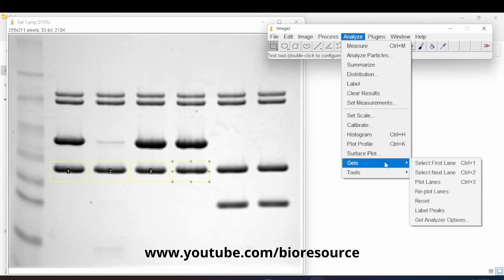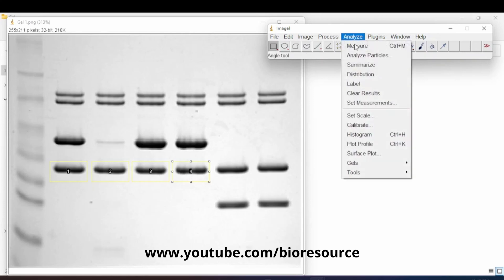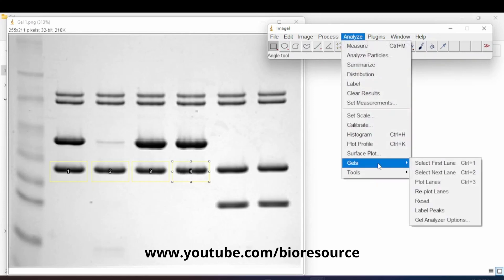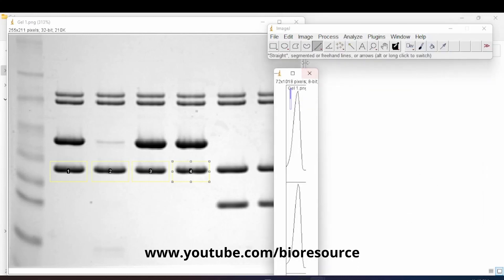Continue selecting 'Next Lane' under Analyze Gels for each band until you have the number of wells you need to analyze — I'll select four for now. Then go to Analyze Gels and select 'Plot Lanes'. This will display the peak intensity profile for each of the selected bands.